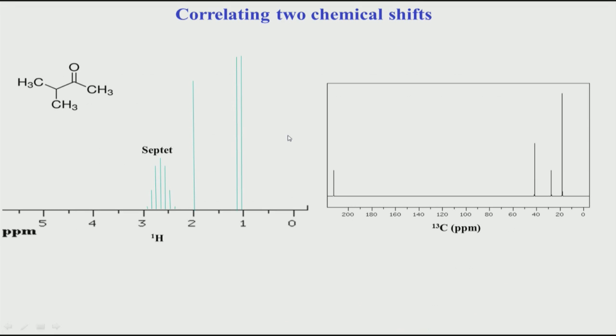So, let us take this example again, this molecule which we saw in the previous class when we were looking at carbon 1D NMR analysis. There we had a 1D spectrum of hydrogen, and we also had a 1D spectrum of carbon. But the question which I raised last time was that there is no connection information between these two. We recorded these two spectra separately, in isolation, so I do not know which proton peak corresponds to which carbon peak, because all of them are CH peaks. Of course, by using a logical idea, you can say this will correspond to this and that will correspond to that, but that is based on logical arguments.